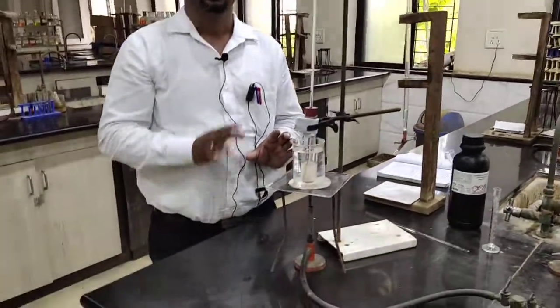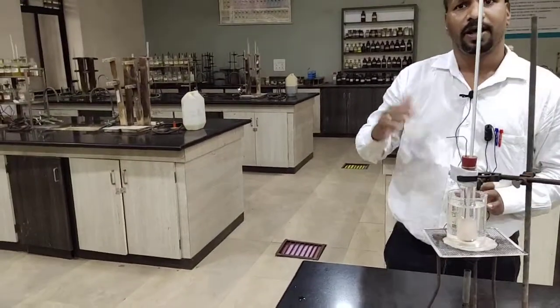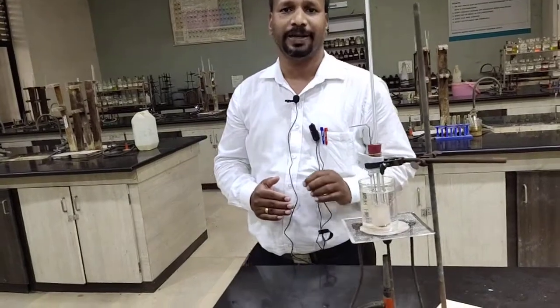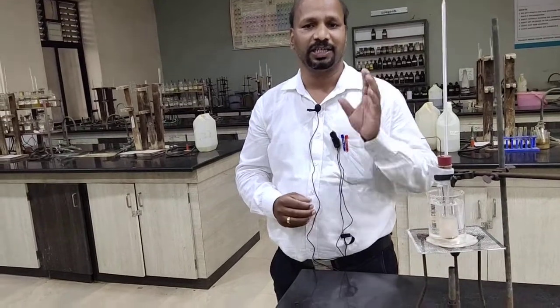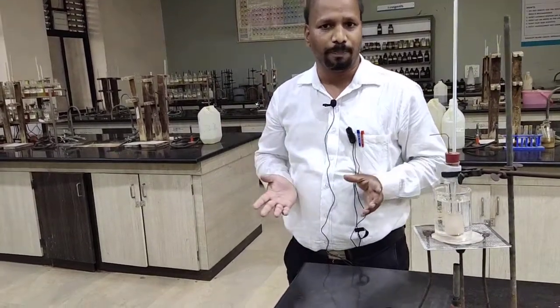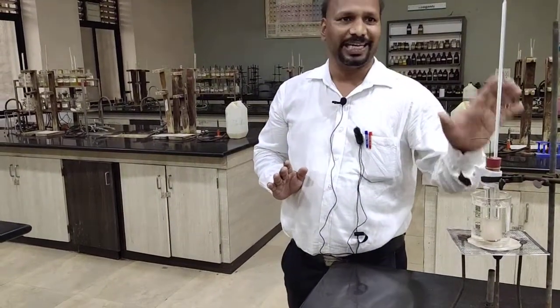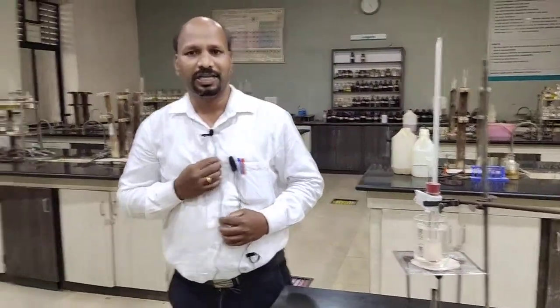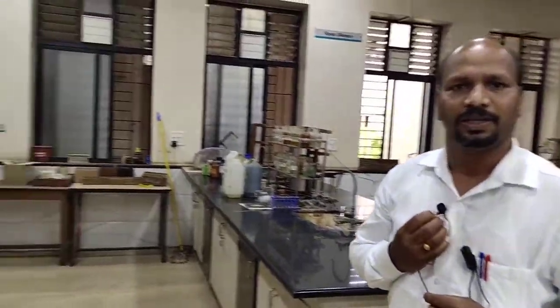So that we will get the mixing temperature. What we did in this experiment is vary the percentage of phenol and water, and note the mixing temperature. From this experiment we have to find out the critical solution temperature of the phenol water system. We know critical solution temperature is the temperature above which all proportions of phenol and water mix in each other. Okay, so this is the experimental part of this experiment. Now the next part, the observation table and calculation result, will be explained by Professor Kale sir.